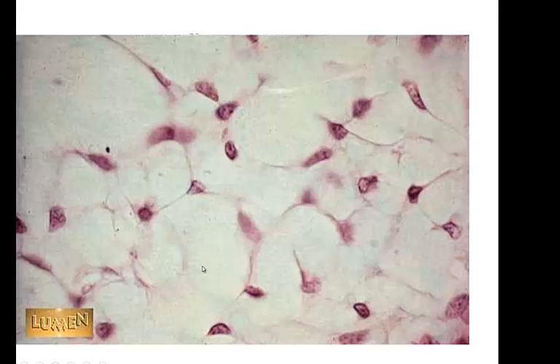Here's mesenchyme. All of the connective tissues come from mesenchyme. This is a tissue slide that you will not have to identify, but it's in your book, so I thought I would show it to you. That's what ties all of these connective tissues together because they look so incredibly different from one another. And here's our first tissue type.